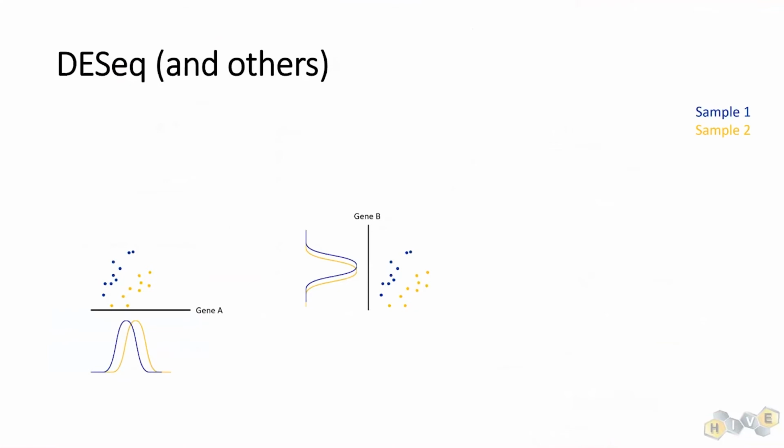If you're just looking at gene B, you still probably aren't going to see any significant difference between those two distributions. Each one of those two genes is one dimension in the data. And so if you're looking for how much of gene A there is, or you're only looking for how much of gene B there is, you'll miss the fact that there's this huge gene A by gene B effect. And so that's what RLDA does. It tries to look for some axis that separates that data.